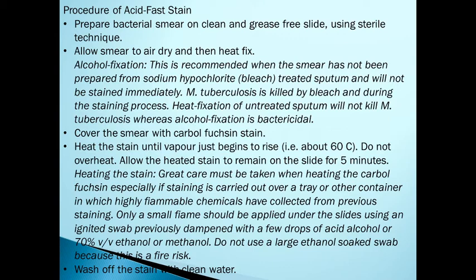that sputum sample may contain highly pathogenic mycobacteria, and if it does, they should be killed. It should get killed, otherwise it may harm the person performing this procedure. So the mycobacteria are killed by bleaching during the staining process. Heat fixation of untreated sputum will not kill Mycobacterium tuberculosis, whereas alcohol fixation is bactericidal. So this alcohol fixation is also preferred.